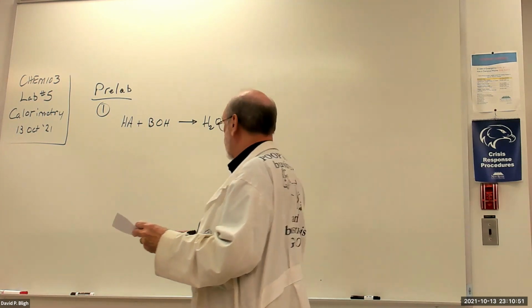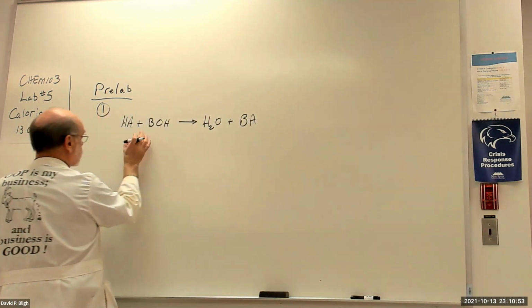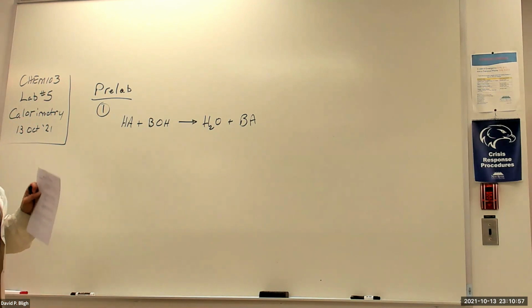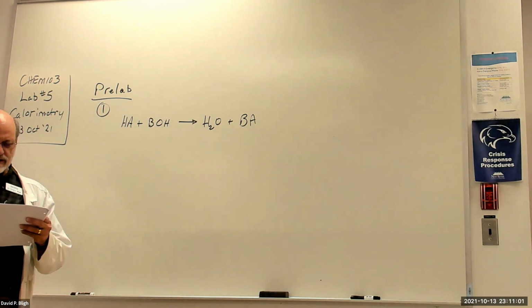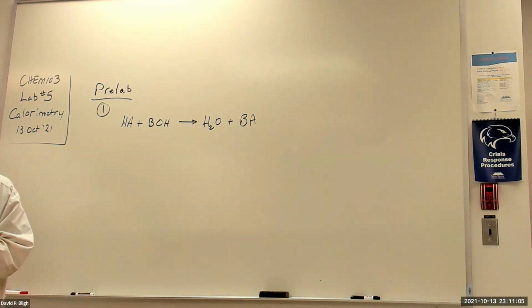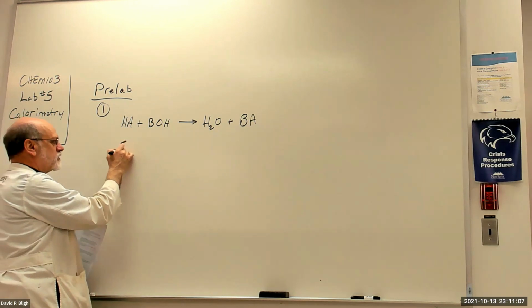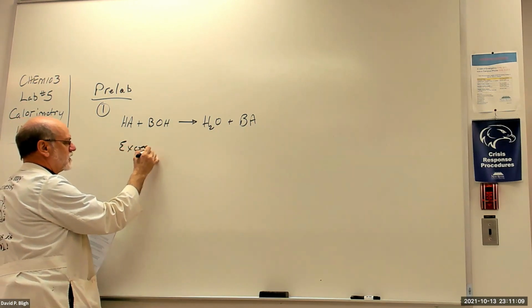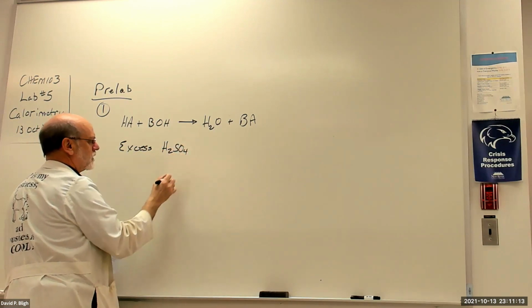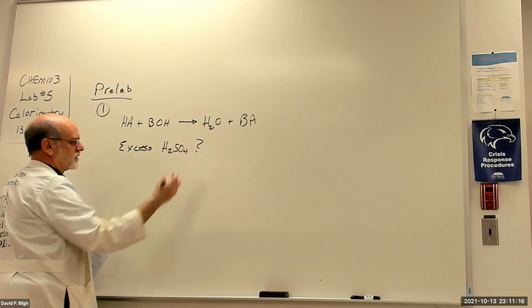Okay. So if this is the stoichiometric ratio, why do we use an excess of sulfuric acid, H2SO4, in this procedure? So why is that?